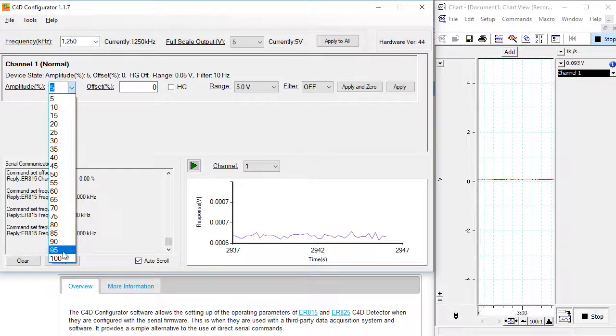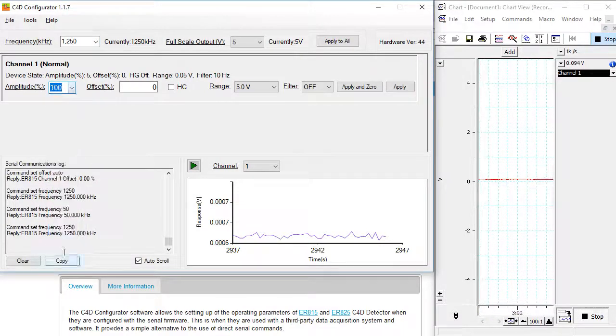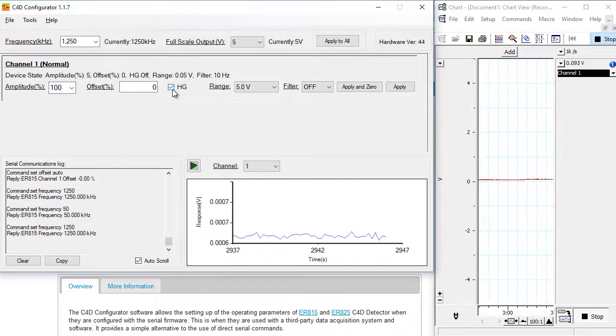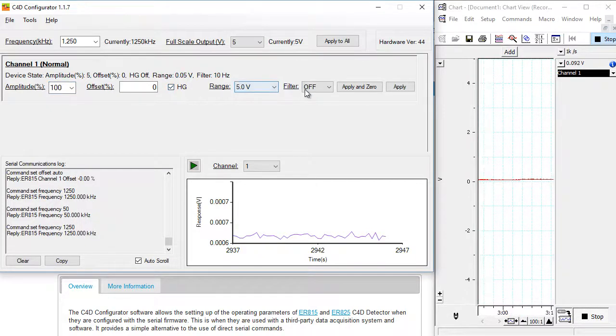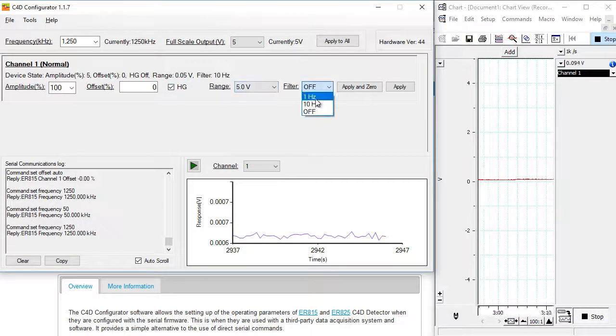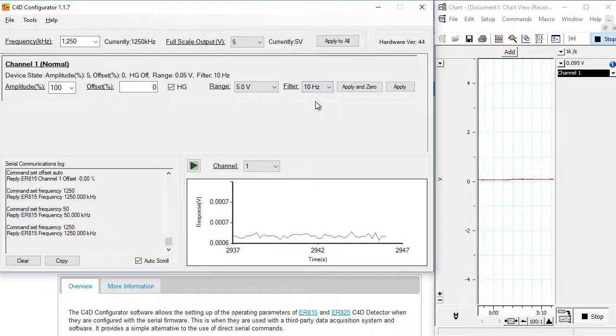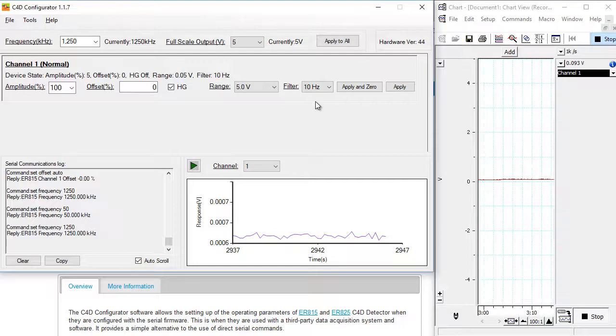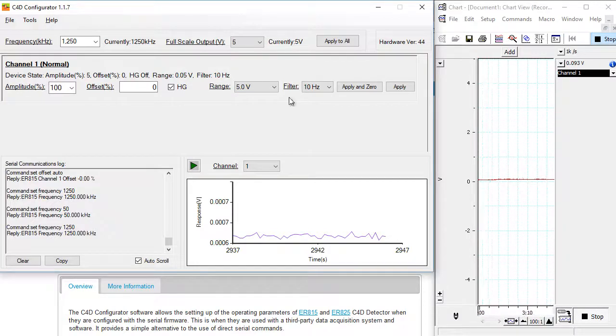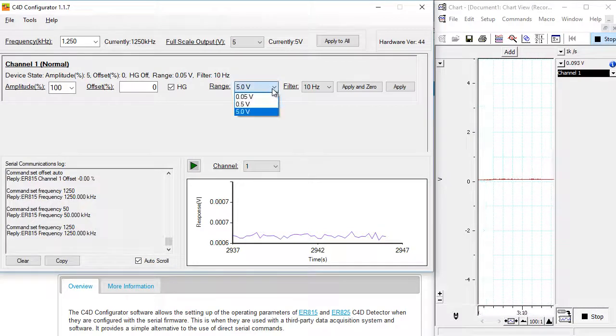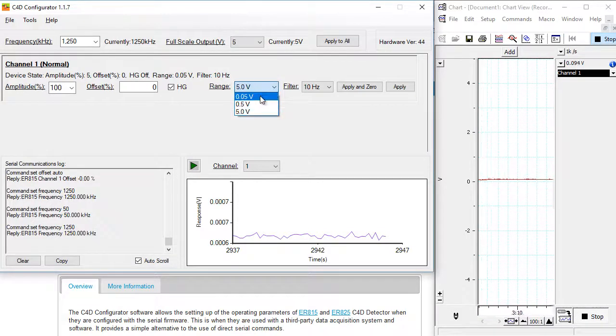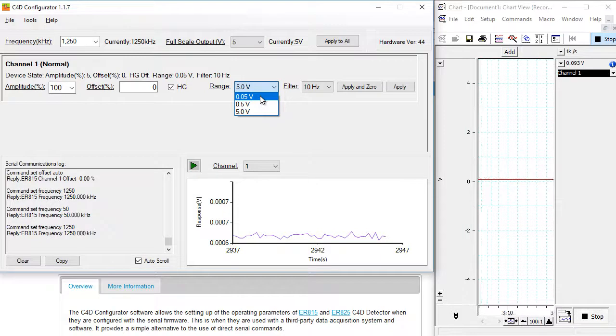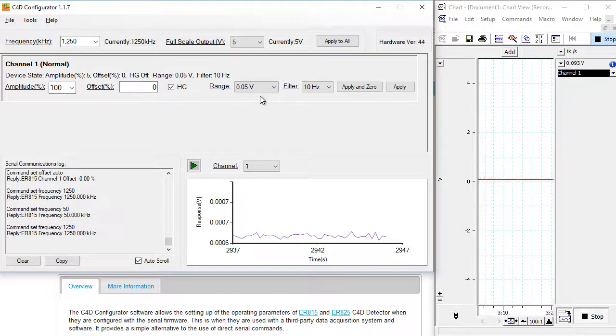The amplitude, I'm going to choose 100%, with the head stage gain on. I'm going to apply a 10 hertz low pass filter for a less noisy signal. And for the range, I'm going to choose 0.05 to see the small peaks.